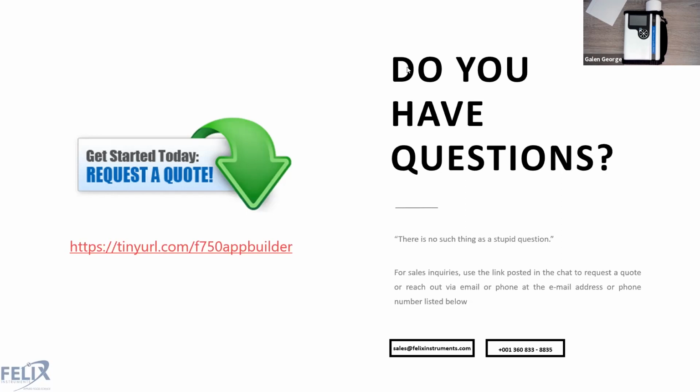However, it is entirely possible to actually see vitamin C. I think it would require further testing to know if it'll actually be a solid quantitative model. It would have to be a pretty robust model, I believe, to be able to determine that quantitatively at that low of a concentration. But I don't think it's an impossible task.